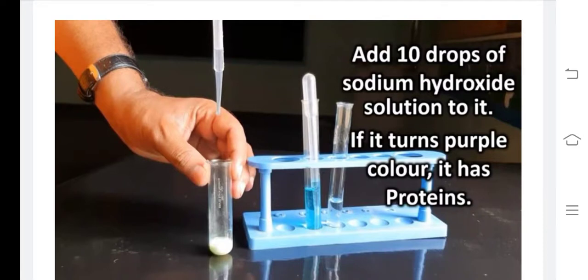If it turns, next what do we have to do? The procedure is over. What do we have to do in the next step? Observation. It turns purple color. What is that, children? It turns purple color. Then what is the inference or conclusion? When we add copper sulfate and sodium hydroxide solution to the gram flour, that food item changes into purple color. Then it shows that the given food material contains proteins.